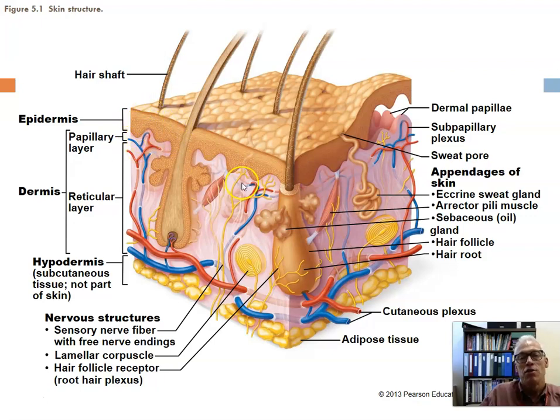And the tissue underlying it, as you know, because it underlies all epithelia, is loose areolar connective tissue proper, or just areolar tissue. And in this case, it has its own special name. It's called the papillary dermis. So this is the part of the dermis that's open in its weave of collagen fibers, contains lots of blood vessels, capillaries to feed the avascular epidermis, contains nerve endings, contains white blood cells to defend the body against invasion by microorganisms if the epidermis is nicked or damaged.